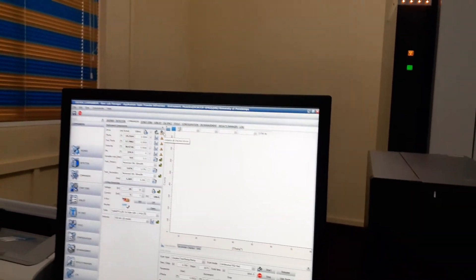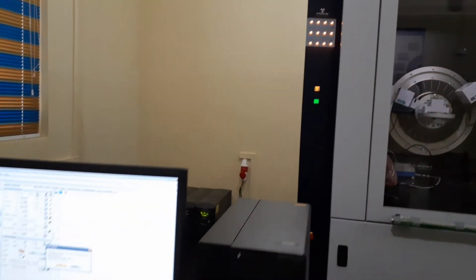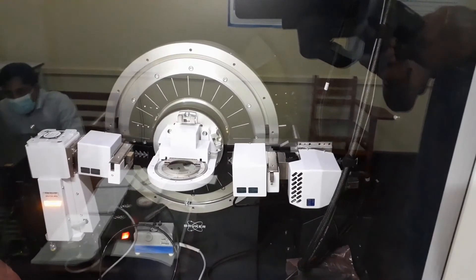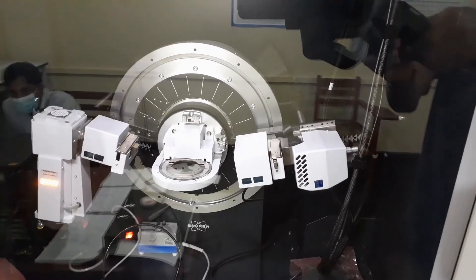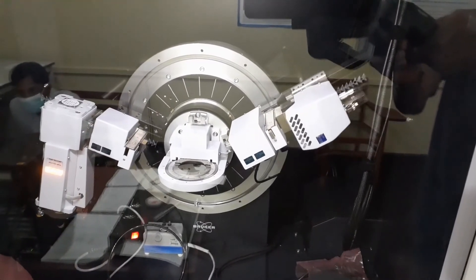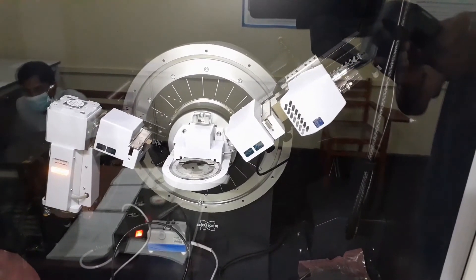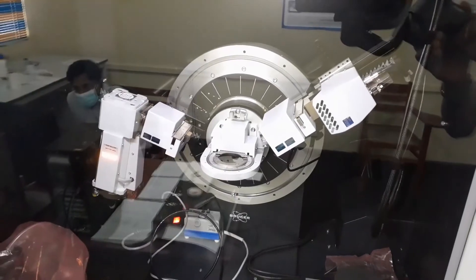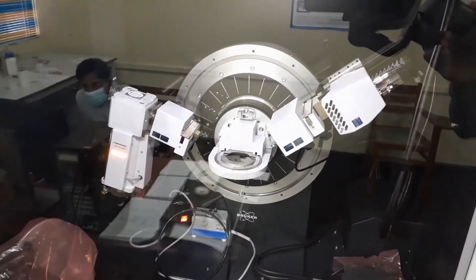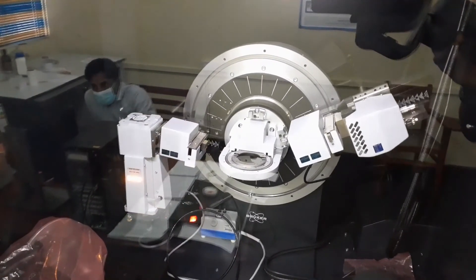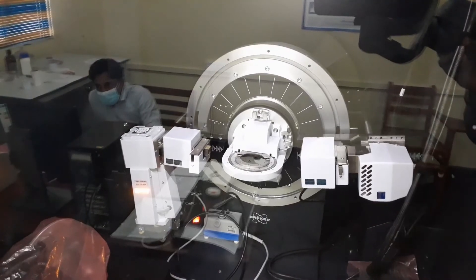Now we can initiate all the drivers. Once initiated, all the drivers will come to their reference points. Then we can bring them down to their zero points.